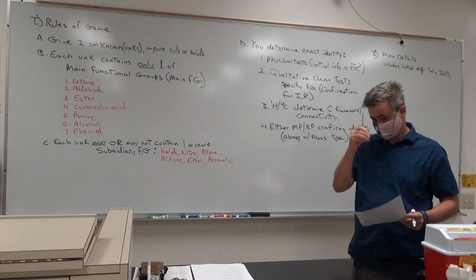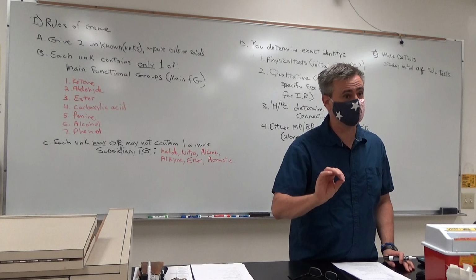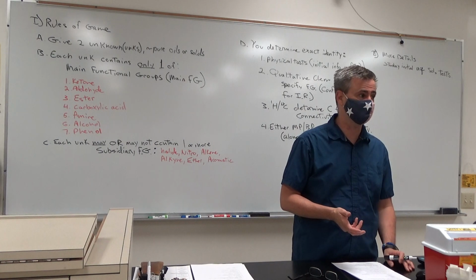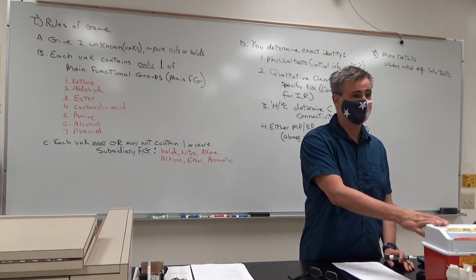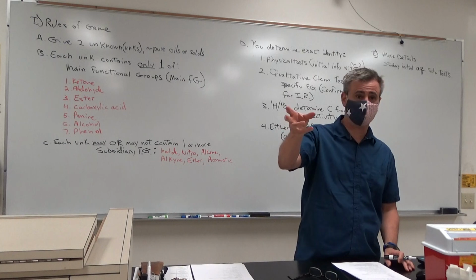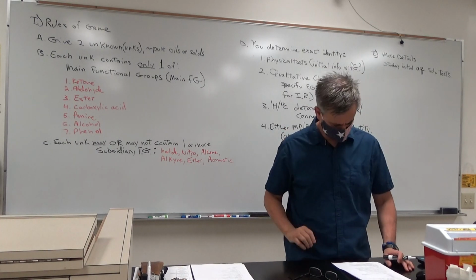When you're doing the solubility test, make sure you're using the right concentration of solution. I forget off the top of my head what concentration of hydroxide you use, but later we will have two different hydroxide solutions, one for a qualitative test and one for the aqueous test. Make sure you're using the right one.